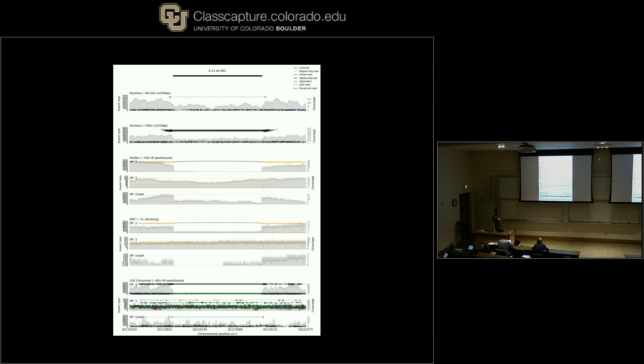All of the long molecule sequencing has haplotype-resolved pairs, so you'll see three different plots for each one. You can see they're all basically in agreement, and depending on the depth, you see more or less evidence. But I think the picture is quite clear here of what's going on.